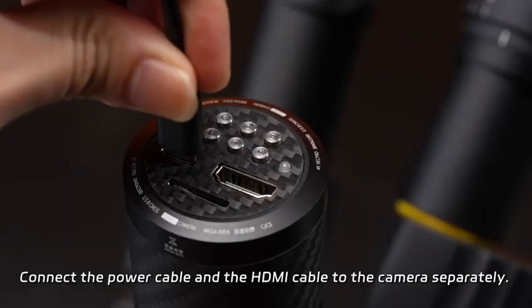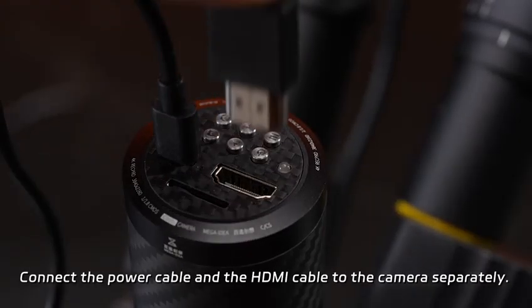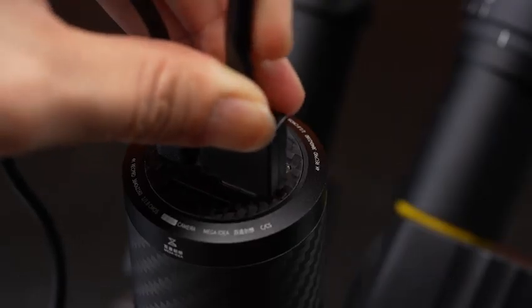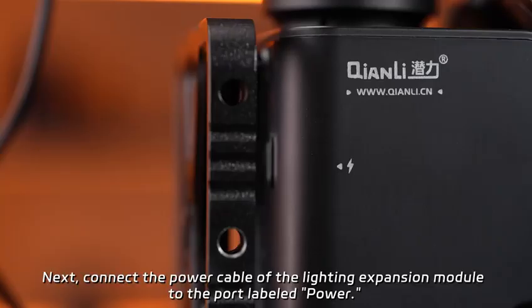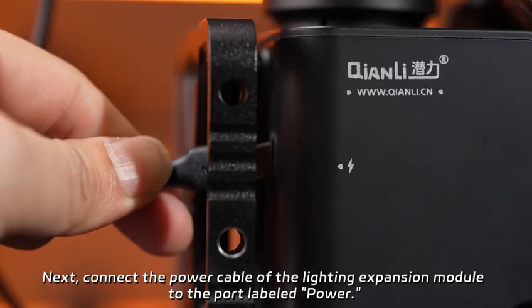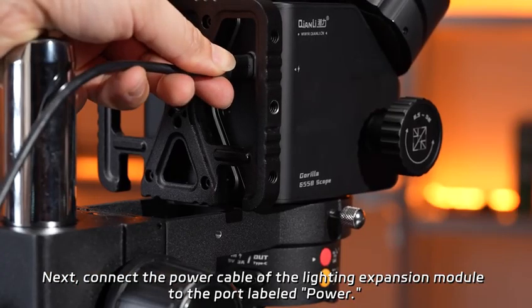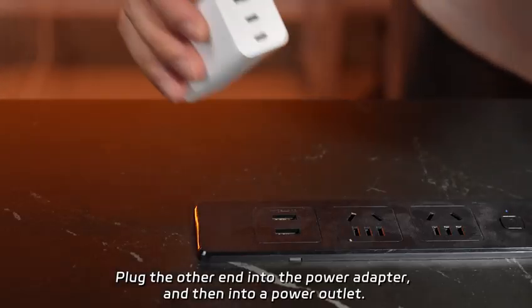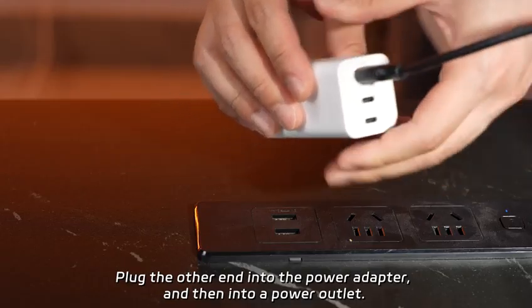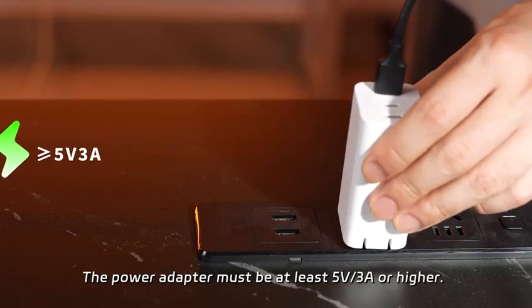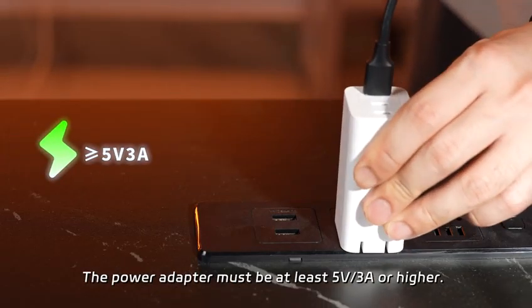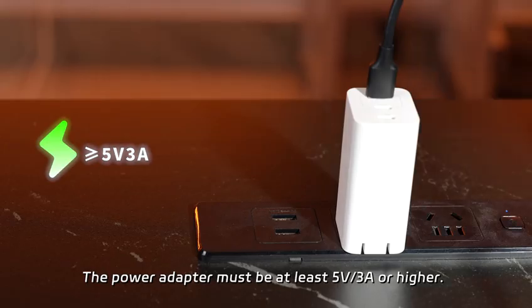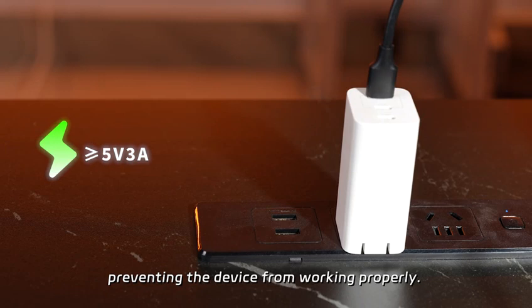Connect the power cable and the HDMI cable to the camera separately. Next, connect the power cable of the lighting expansion module to the port labeled Power. Plug the other end into the power adapter and then into a power outlet. The power adapter must be at least 5 volts or higher. Using a lower current may result in insufficient power supply, preventing the device from working properly.